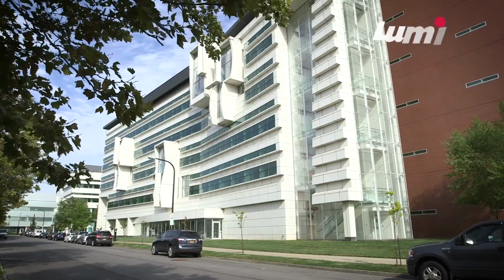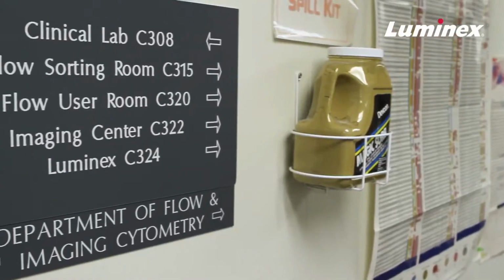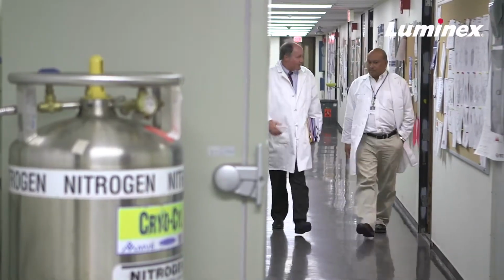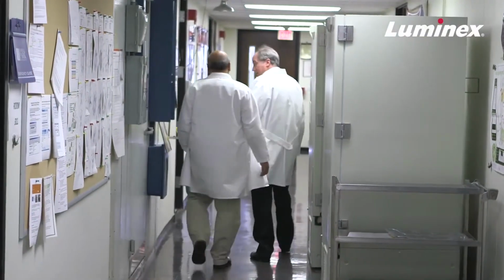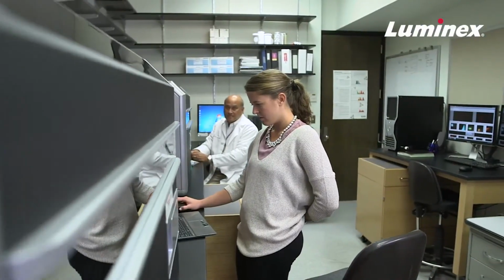We are a core facility at the Roswell Park Cancer Institute, and in that capacity we serve a wide user base with different research interests. So we see lots of different applications of flow cytometry and imaging flow cytometry. Our goal is to really provide our user base with the best instrumentation, quality control of the instrumentation, and best practices in using the instrumentation.